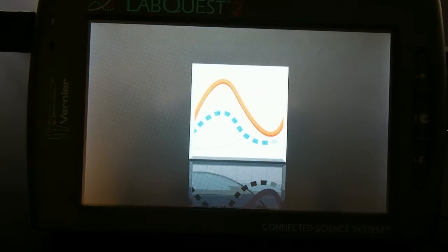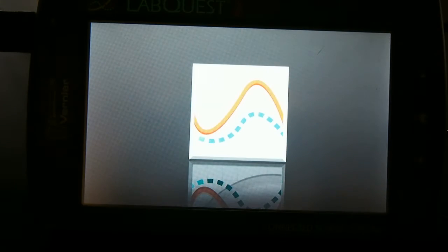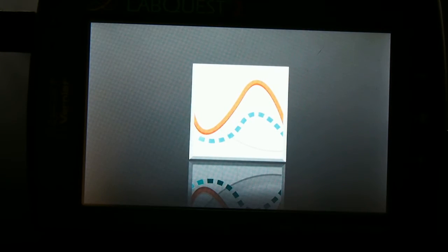You can firmly press the power button to turn it on. You may see this flash of light, and you'll see this indicator to illustrate that it's on. It may flash on and off a couple of times. If it hangs at any one stage, please reset it or replace the unit.